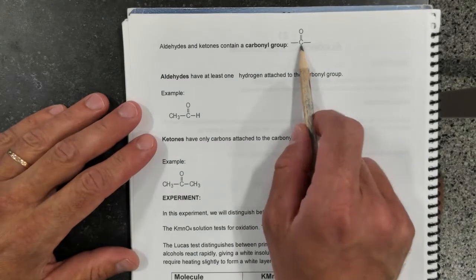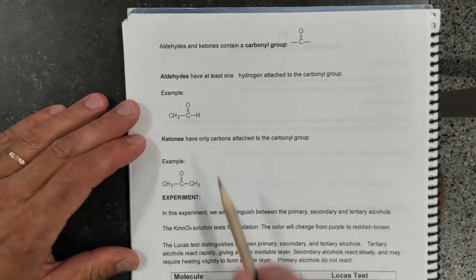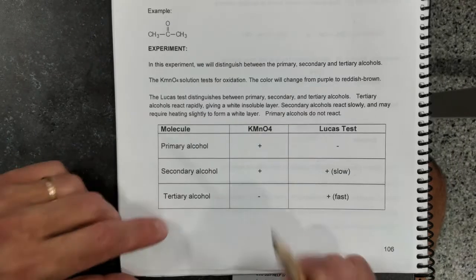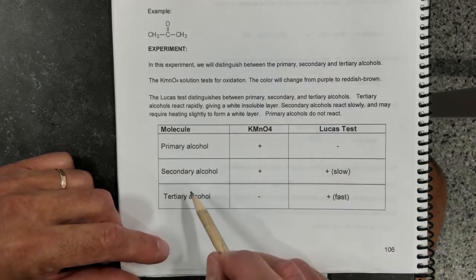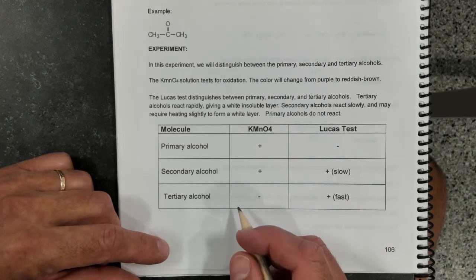Aldehydes and ketones contain a carbonyl group. Aldehydes have at least one hydrogen attached to the carbonyl group. Ketones have only carbons attached to the carbonyl group. So we're going to be using two testing systems. One is based on oxidation of primary and secondary alcohols by potassium permanganate. Tertiary alcohols cannot be oxidized.